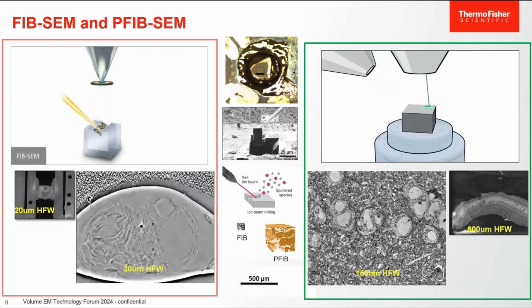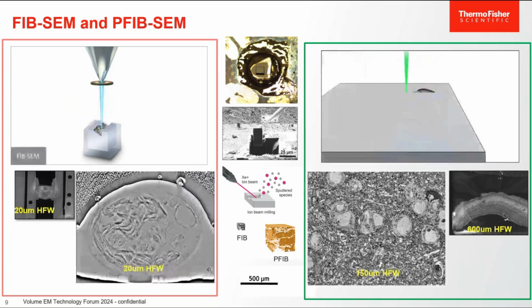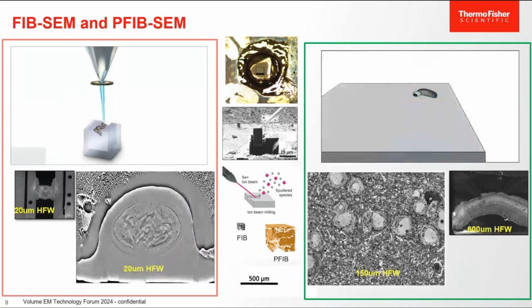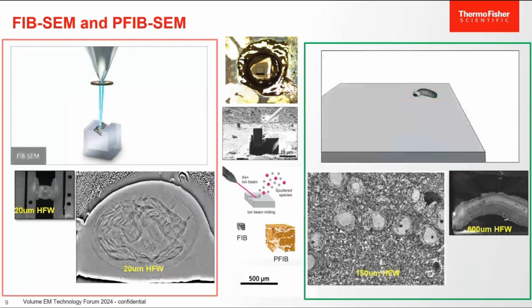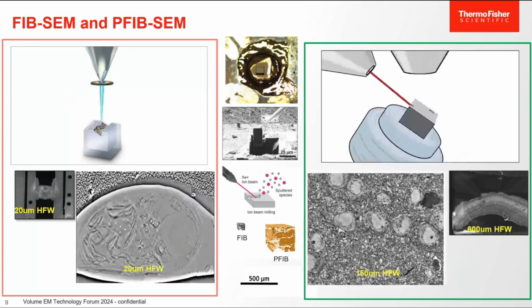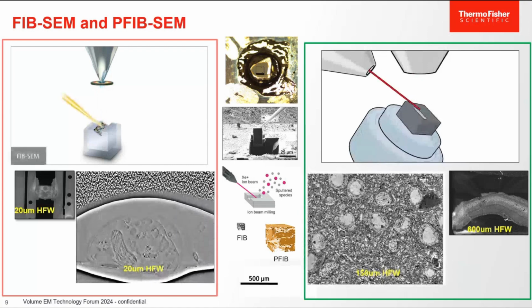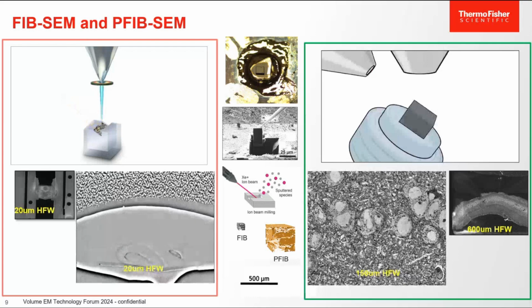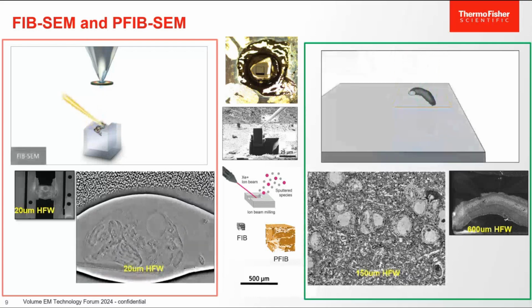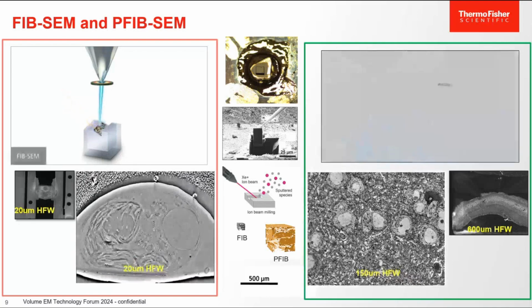In the lower movie I'm playing, this is just a typical brain sample, but this is a selected area on one of the spin mill zones collected over a 24-hour period, and you can see that you can really capture a lot of detail there. On the right, you can see a retinal sample, just to give you an idea about the cut face that we're opening up. We're spin milling there across the whole surface, so it's roughly equivalent to what you would get from a microtome-based technique these days.